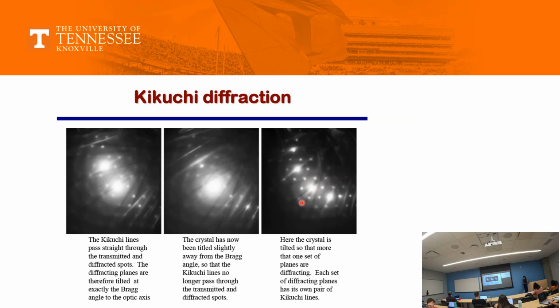So here, this is nothing but the image of the planes. Diffraction patterns contain these spots and also these lines. And these lines are the road maps of your crystal. Following these lines, when you're in a diffraction plane, you can go from one zone axis to another zone axis. You can take an image from 101 zone axis to 111 zone axis.